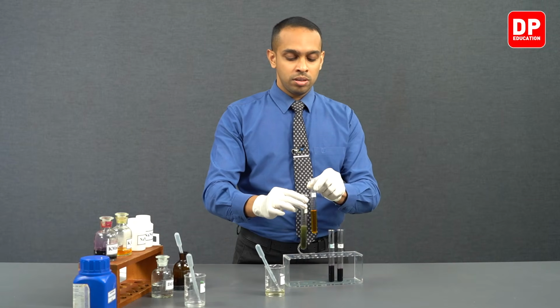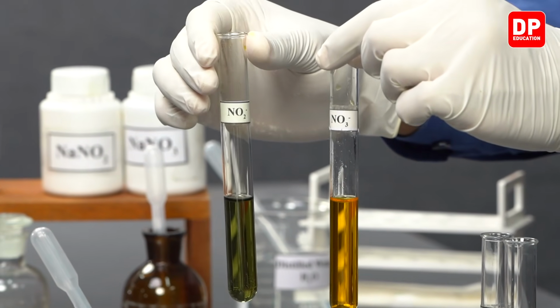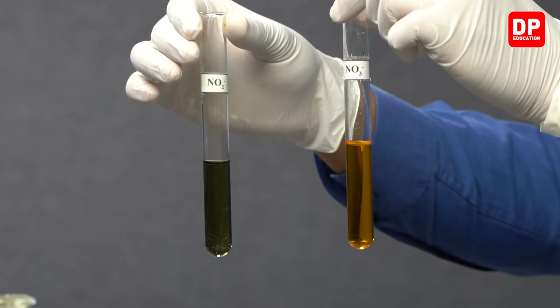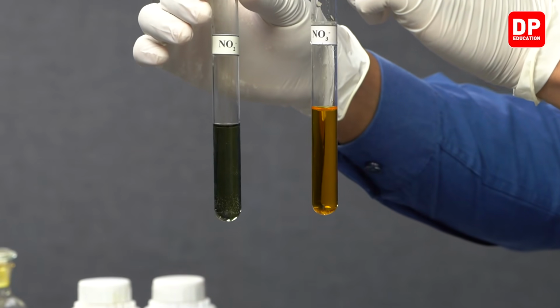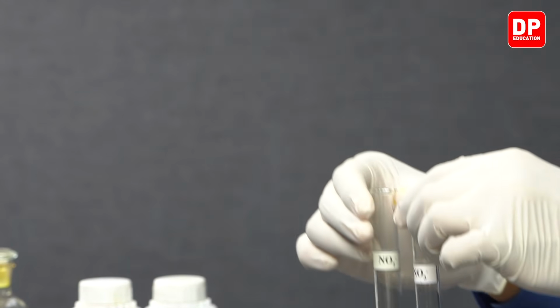So now, students, you can observe that when we added nitrite ions to acidified potassium dichromate, we have formed a green color solution. Earlier on, the acidified potassium dichromate was orange in color, but now you can very clearly observe the green color solution that we have formed.